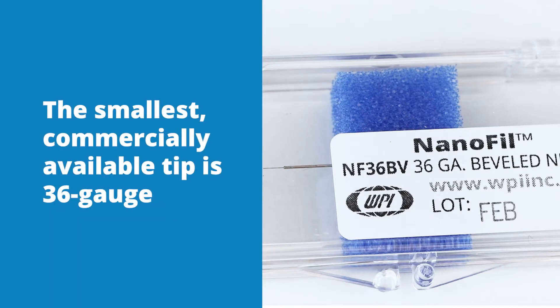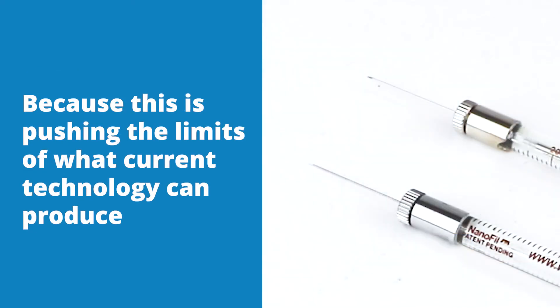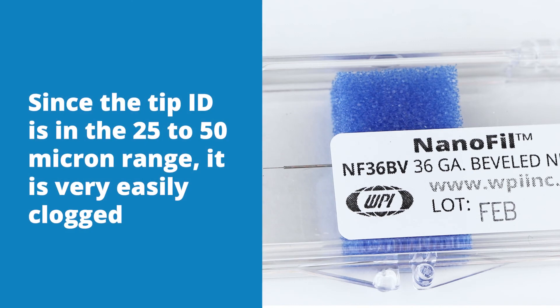The smallest commercially available tip is the 36 gauge. The tip is so small that it can be inserted into the opening of the 33 gauge needle tip. Because this is pushing the limits of what current technology can produce, there are some limitations to consider before using it. Its thin diameter makes it necessary to limit its length to 2.5 to 3 mm and still maintain stable strength. Since the tip ID is in the 25 to 50 micron range, it is very easily clogged.